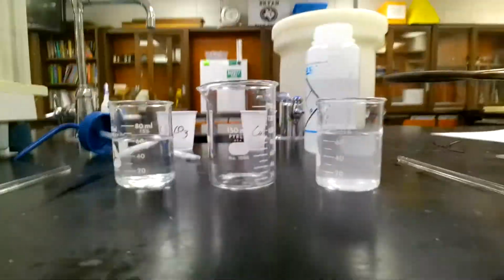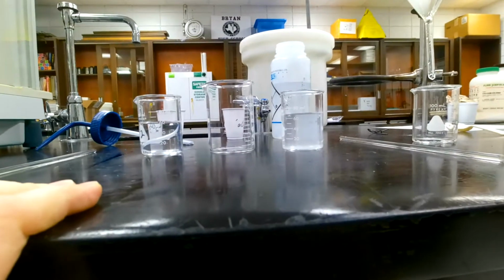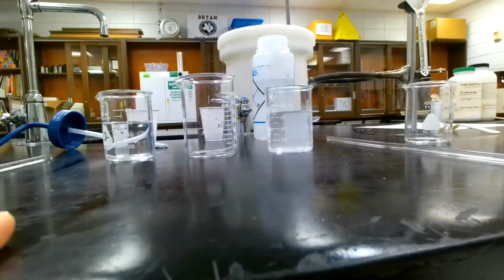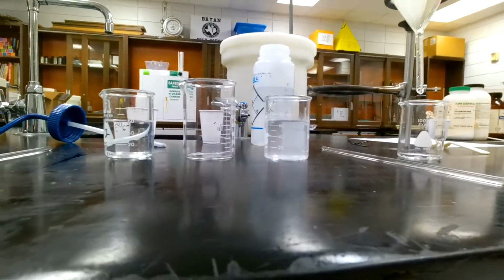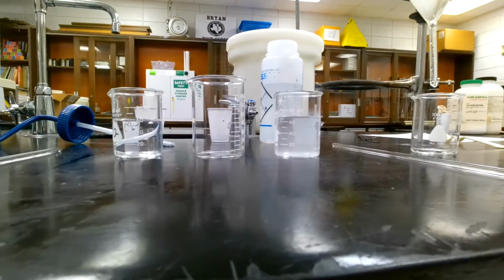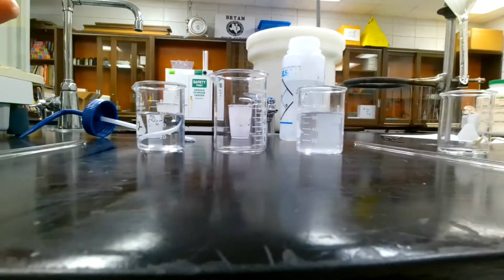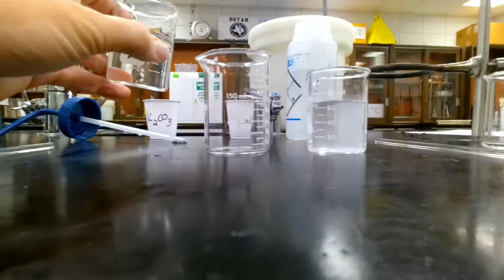Now, I said earlier that it doesn't really matter what amount of water goes in there, and as you can tell, they have different amounts of water. But I had an oversight, and figured out that if I pour this beaker into this beaker, the beaker's not big enough, so I had to go grab a new one. We'll just go ahead and combine the two.